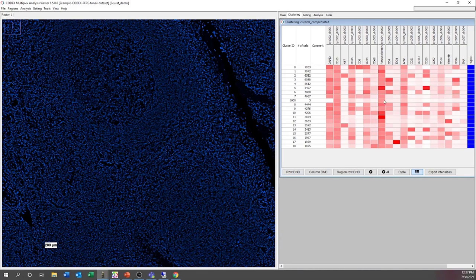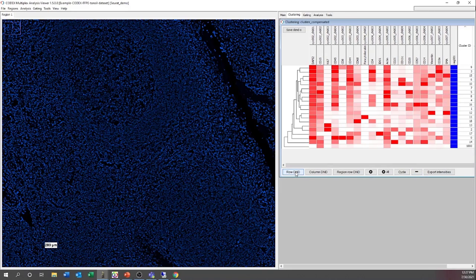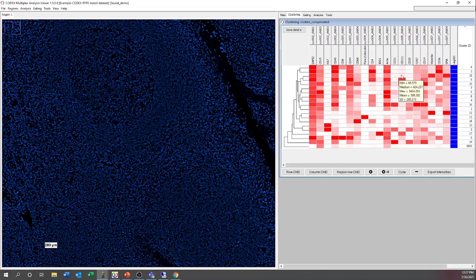Let's take a look back at CODEX MAV and see how we can utilize all these tools together to analyze our data. I'm going to scale by populations and turn on the row dendrogram so we can see the most similar populations. Let's look at how we might use this dendrogram to identify similar clusters. We see that clusters 15 and 6 are very similar because the lines are connected. They're both CD4 cells, but one population has very low or no expression of CD11C and the other has high expression of CD11C.